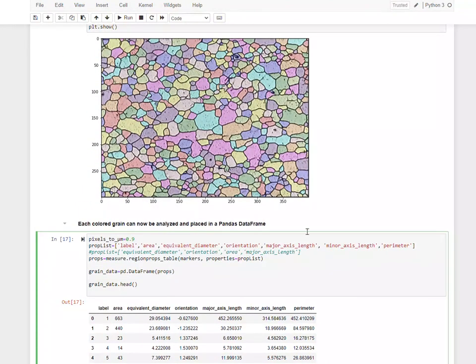But what you can do, if you don't have that handy, is if your picture has a micron bar in it, and it's labeled as 100 microns or something like that, you want to go ahead and display your image, and then pick off the pixel values for the start of the bar and the end of the bar. That'll tell you how many pixels there are for whatever the bar length is, and that's how you can get your pixels to micron.